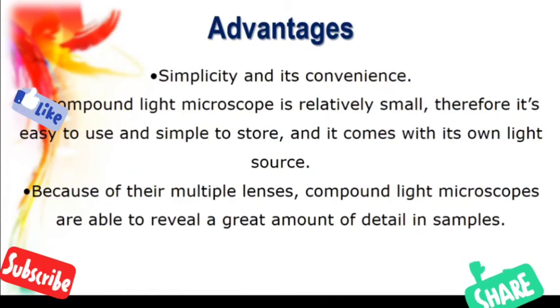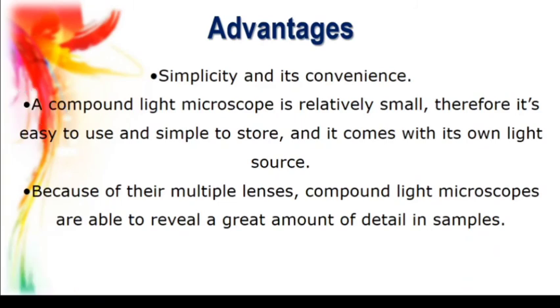Let's see the advantages of the compound microscope. It is simple and convenient. A compound light microscope is relatively small, therefore it is easy to use, easy to store, and easy to carry from one place to another. As it has multiple lenses, a compound light microscope reveals a great amount of detail in the sample.